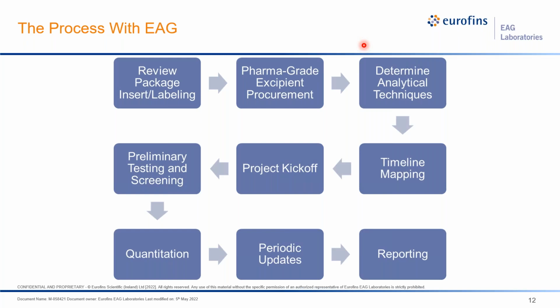They're going to go through, look at the insert, and determine what grades of materials we need to get. They're going to look at the analytical techniques that we might need, and map it out in a different way than I did, by excipient rather than as a project as a whole. So that project kickoff happens.